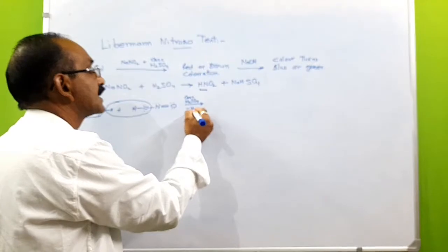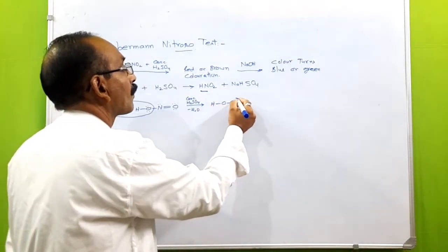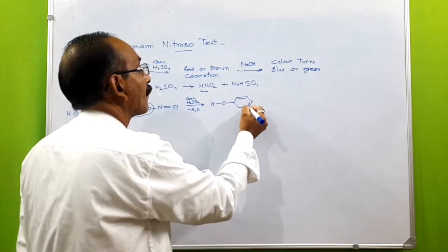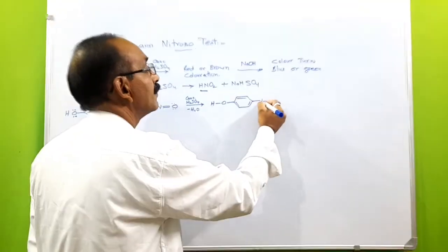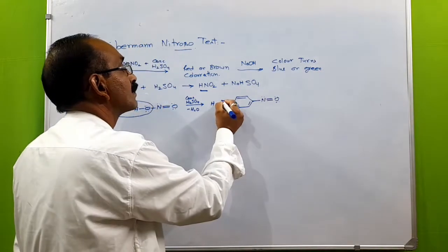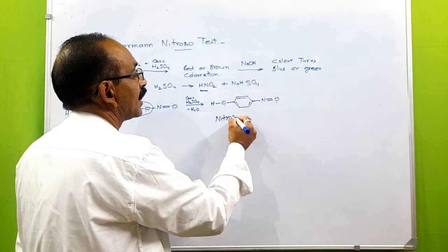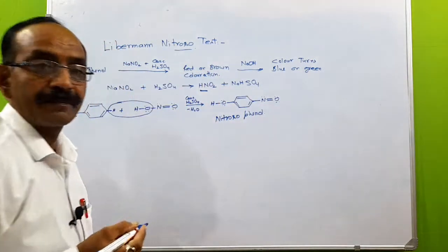Here a water molecule sits free, and this carbon will form a bond with the NO. See, we get our nitrosophenol here.